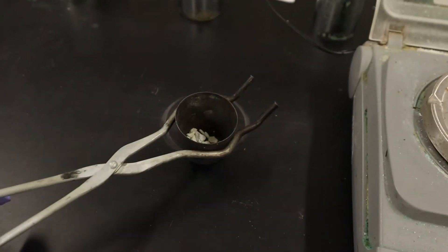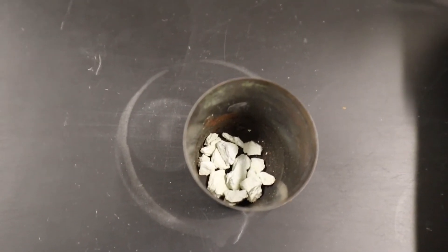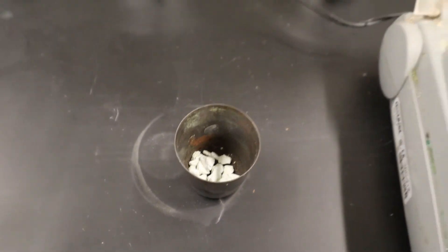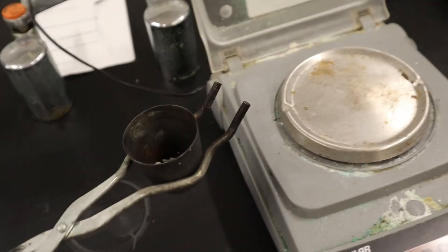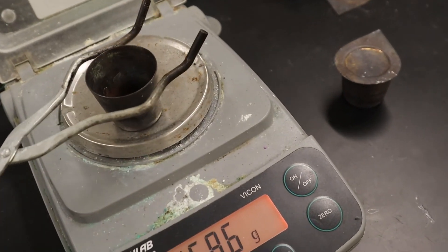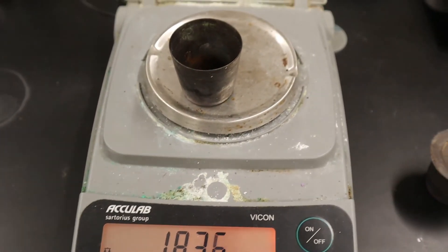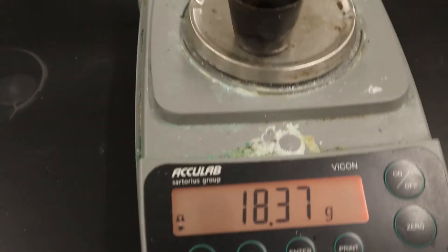I put it on the scale and it's reading 18.37 — last time it was 18.38, so we're getting a little bit less. We're going to do one more heating. I take it and put it back on the ring stand. We're almost done.